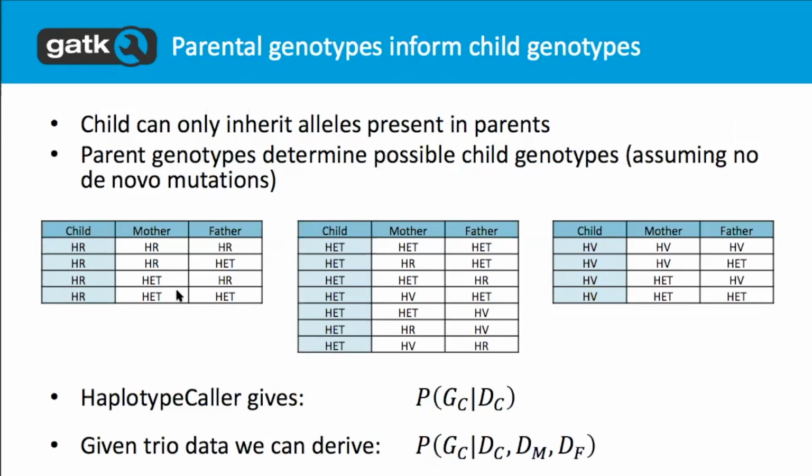Now, there's another consequence of doing this: we can evaluate how confident we are when we have a family pedigree, and we can use that information.